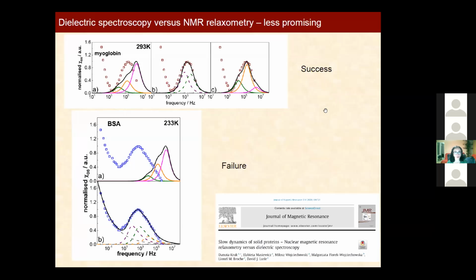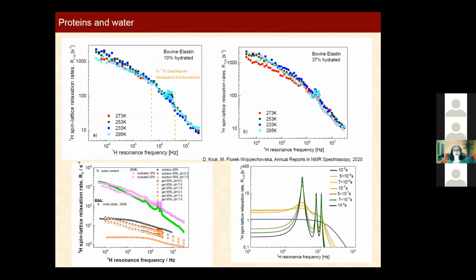Too nice to be true. Like Robinson argued, whatever you do here, there's no way with those peaks, whatever amplitude I take, to get a maximum here. Why? I don't know. However, this is the result of the comparison. Let us go further. Let us add some water.